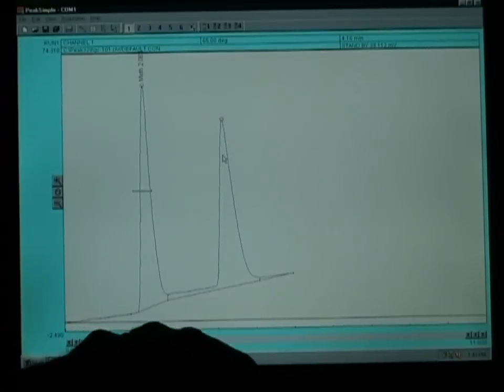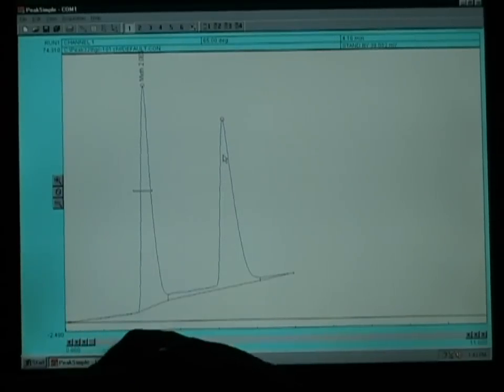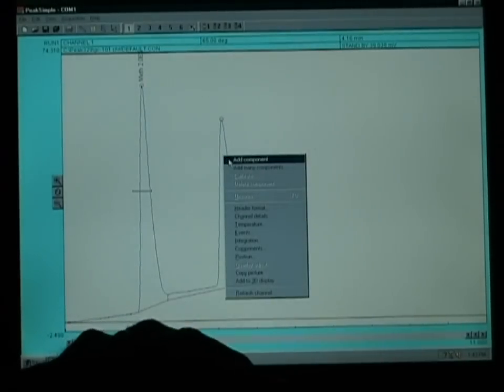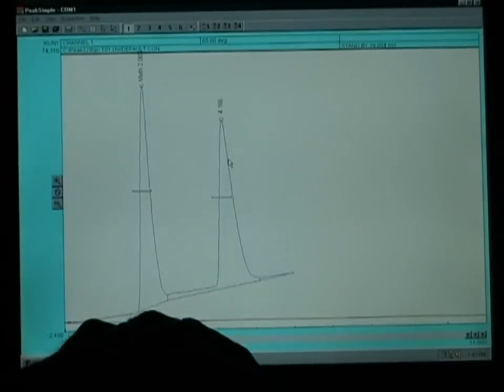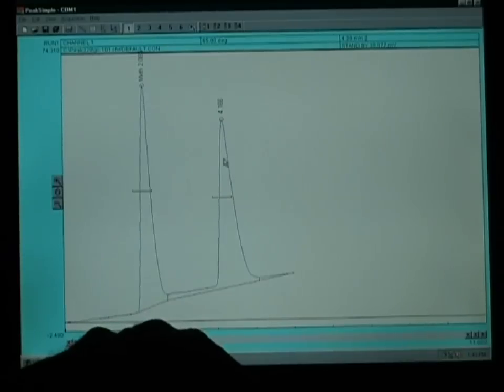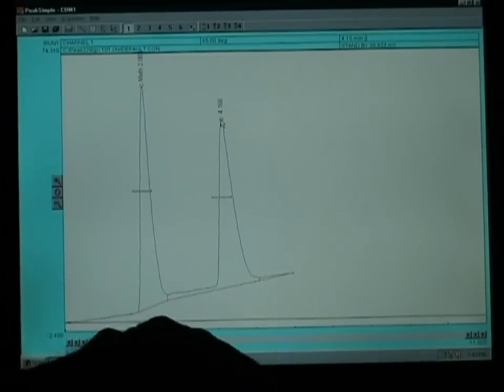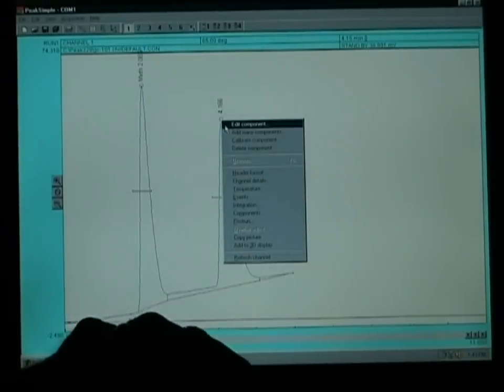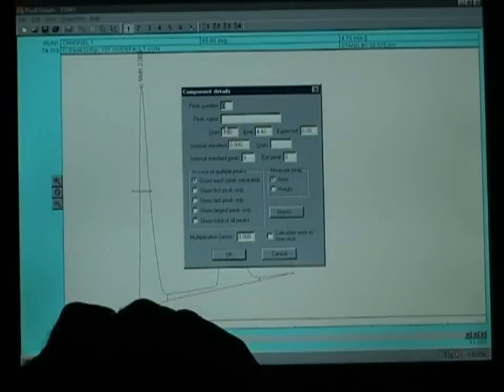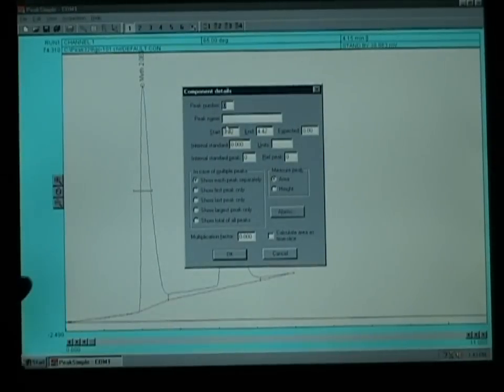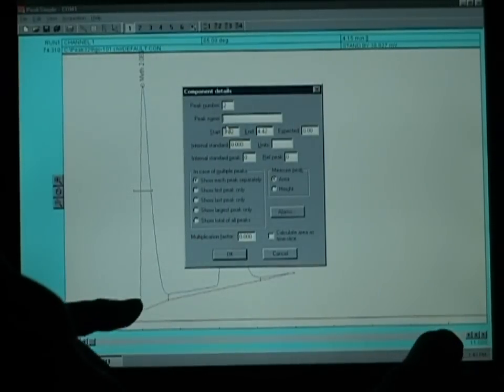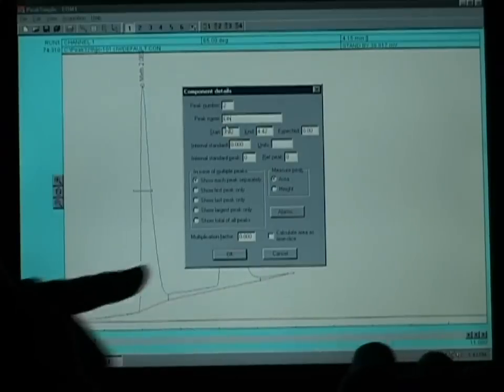If we want to calibrate, we can input a unit as percent or parts per million. Then we repeat with all the components, right click, left click Add Components, right click, left click Edit Components and Component 2 is Ethanol.